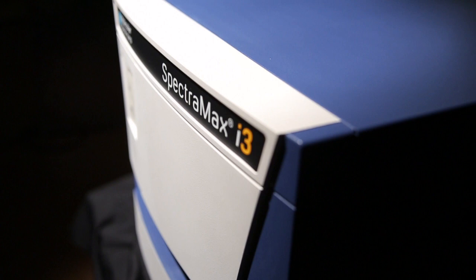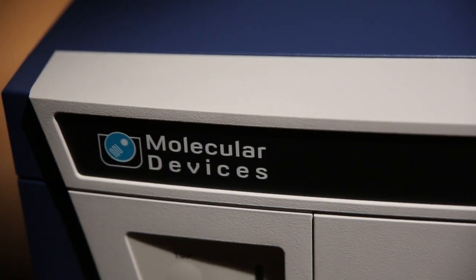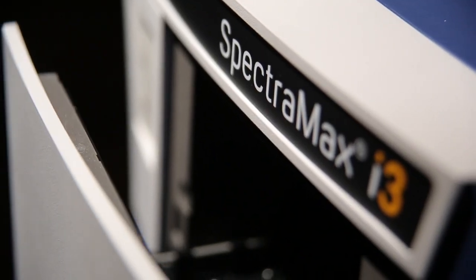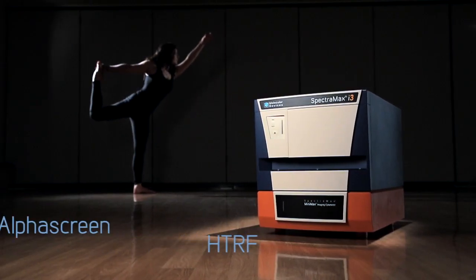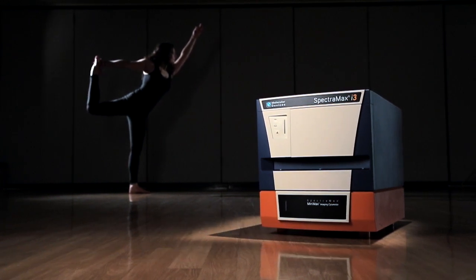The SpectraMax i3 is a multi-mode platform that delivers everything from ultraviolet to visible absorbance detection, fluorescence intensity, and multicolor luminescence. Today, with the flexibility to add cellular imaging, HTRF, AlphaScreen, fluorescence polarization, and much more when you need it in the future.